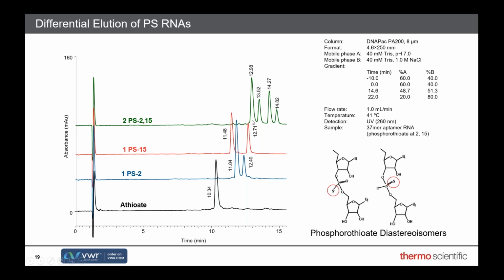So what tends to happen, you get a broad humpy peak where the column's trying to effect the separation, but it won't manage it. So your peak shape looks horrible with sodium chloride. That's where you now need to dumb down the separation and use perchlorate and force the separation to size only. So for this separation on a fully thiolated molecule, you'd always go to perchlorate.